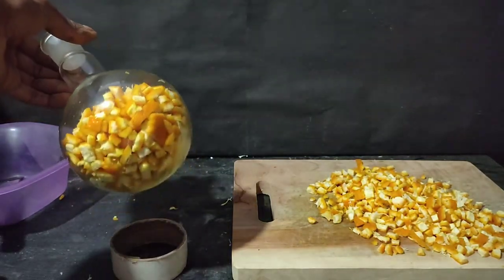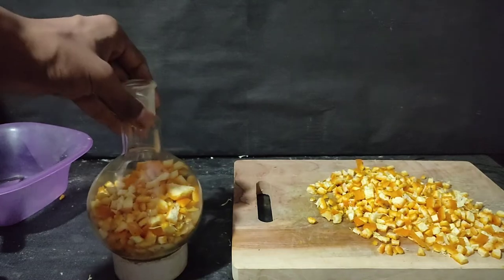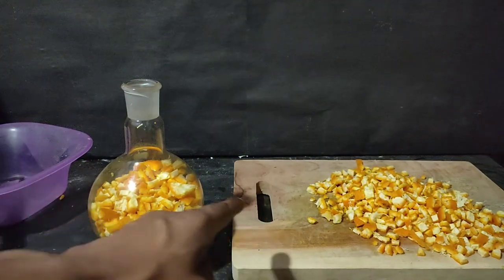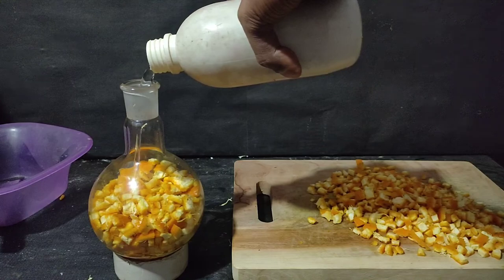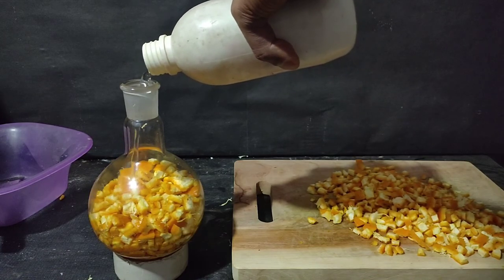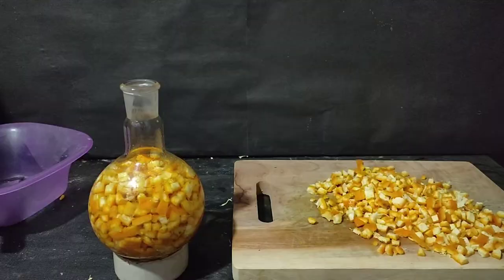Only half of the peels came inside my round bottom flask, so I kept these peels aside and added some water inside the flask. Then I set the apparatus for steam distillation.